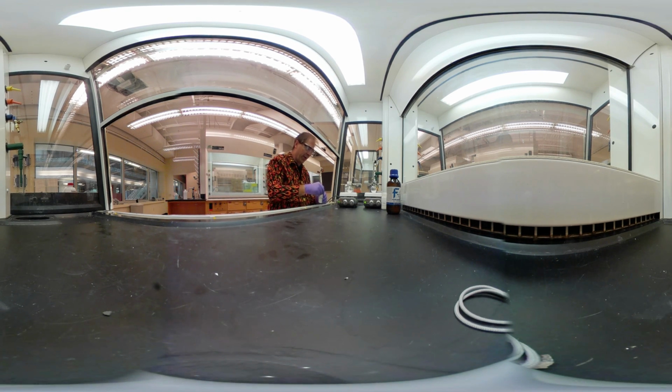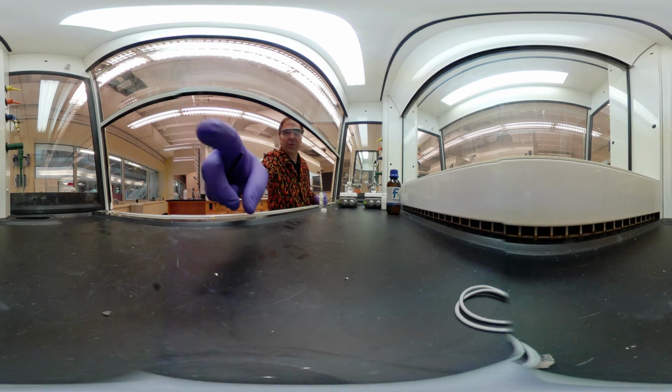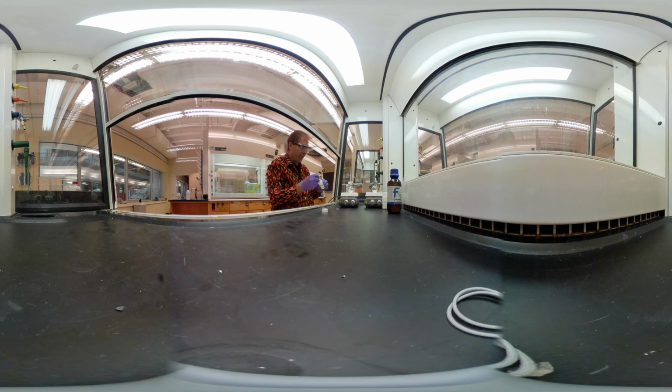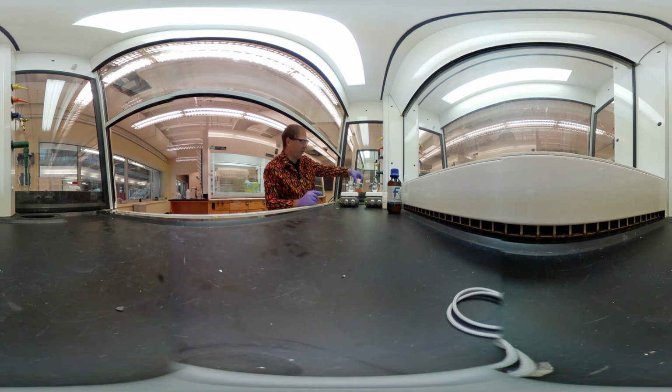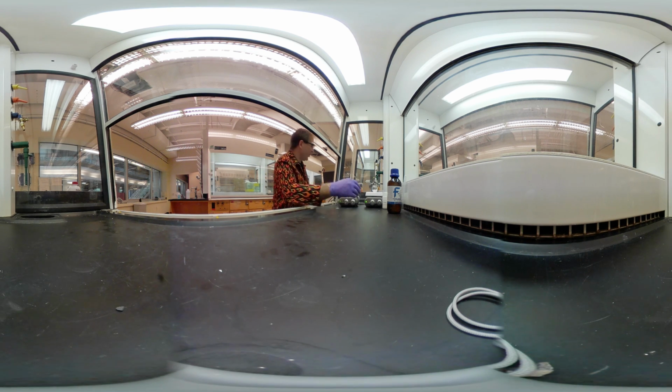So what we're going to do is approximate this, and it's just the tip of a spatula worth. Oh, camera's falling over again. There we go. Okay, so we're going to put a spatula tip, and I'm talking about just a little bit here, into each one of these. So I got it in this one. Similar amount in this one. This changes the ionic character of our solution and helps our reaction go. Okay, so get this going, nice and vigorous stirring.